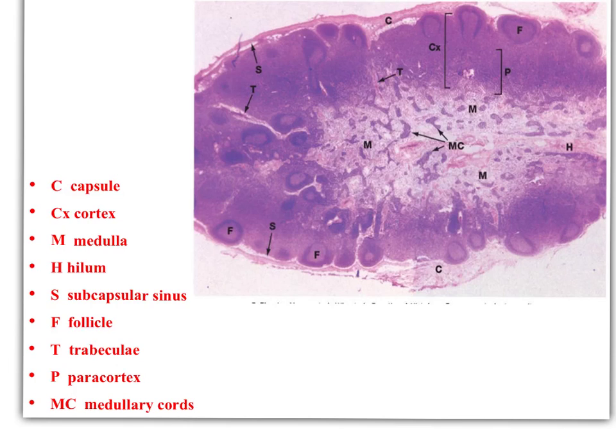Here, T for trabeculum. For the reddish line, it is the trabeculum. For the white area beside this line, it is the trabecular sinus. So take care. The white area is the sinus. The red line is the trabeculum.